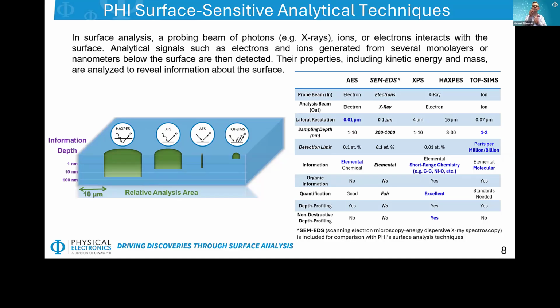The diagram on the left summarizes some of the most important differences between the surface analysis techniques in terms of information depth and the size of the analysis area. We will come back to this diagram and table to fully connect the dots later.